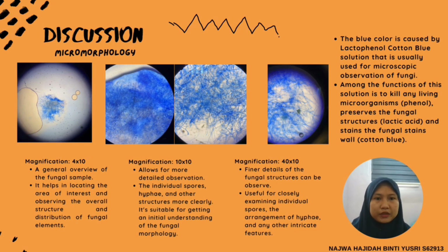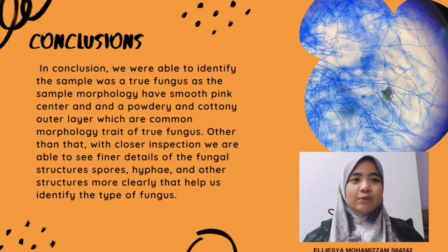In these three pictures, we can see a blue color occur at the fungal area. The blue color is actually caused by the lactophenol cotton blue solution that we usually use for microscopic observation of fungi. Among the functions of this solution are to kill any living microorganisms, preserve the fungal structure, and stain the fungal wall.